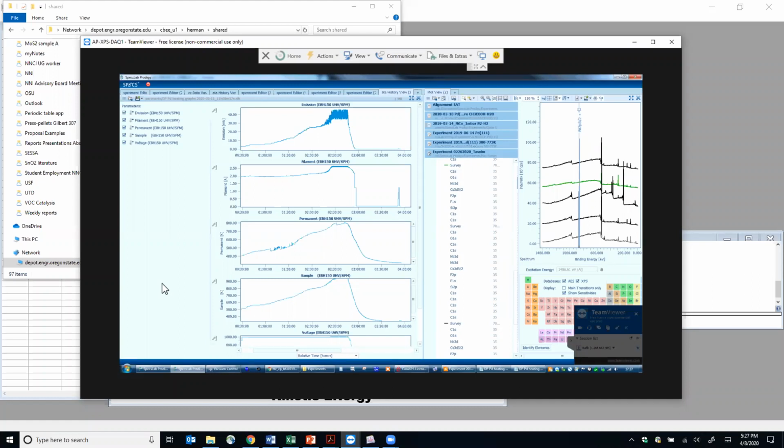I just wonder, do we want to know the ratio of the defects? For example, if it's MoS2, do we want that catalyst to be like MoS1.5, that is the most effective catalyst?